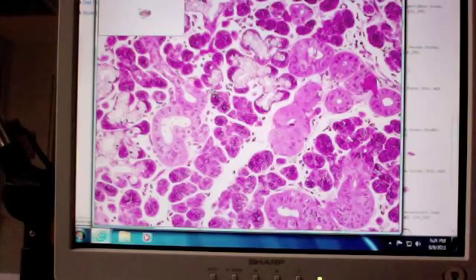What else can we call it? Is it also seromucous? Why can we call it seromucous? What are these cells secreting here? These pale staining cells? These are mucus. These cells in this acinus, all of these cells are serous secretory. And no, sebaceous does not spell serous.